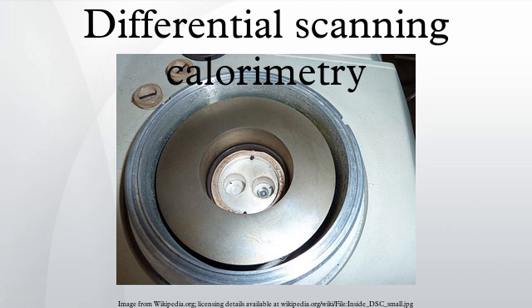At some point, the molecules may obtain enough freedom of motion to spontaneously arrange themselves into a crystalline form. This is known as the crystallization temperature. This transition from amorphous solid to crystalline solid is an exothermic process, and results in a peak in the DSC signal. As the temperature increases, the sample eventually reaches its melting temperature. The melting process results in an endothermic peak in the DSC curve.